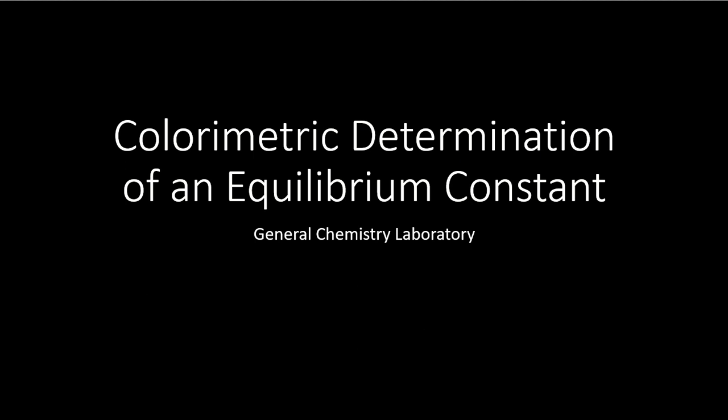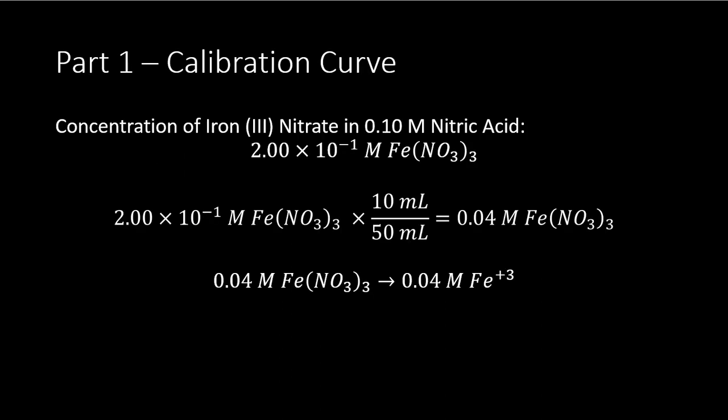All right. Hello, general chemistry. Welcome to this description on one of our labs with the spectrophotometer, the colorimetric determination of an equilibrium constant. It's going to be broken up into two parts. Part one will be getting to a calibration curve.